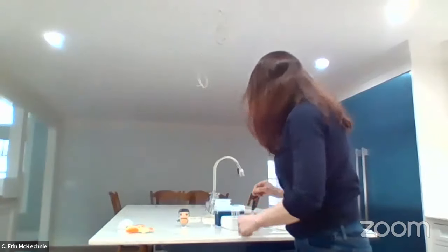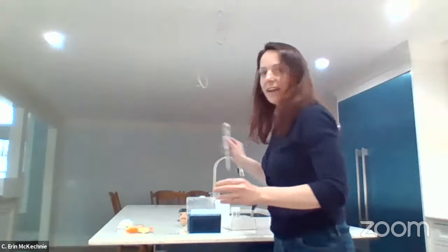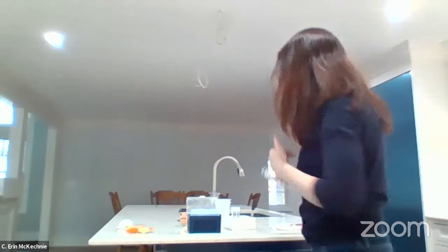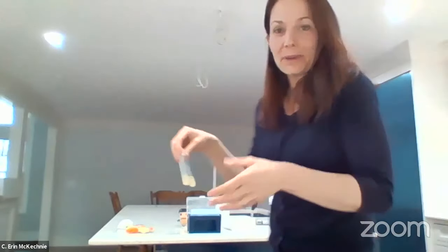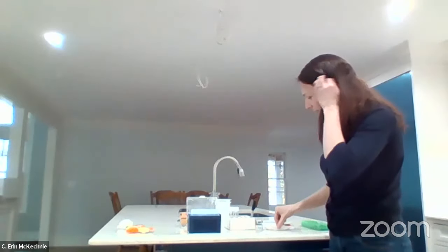All right, so first thing, I'm going to do some measurements. So I have some tips, and this is a pipette. I'm going to be measuring 250 microliters today. And although I do have my bacteria labeled here, I'm just going to mix them up because I want to figure out if we can really use these antibiotics to solve this mystery.